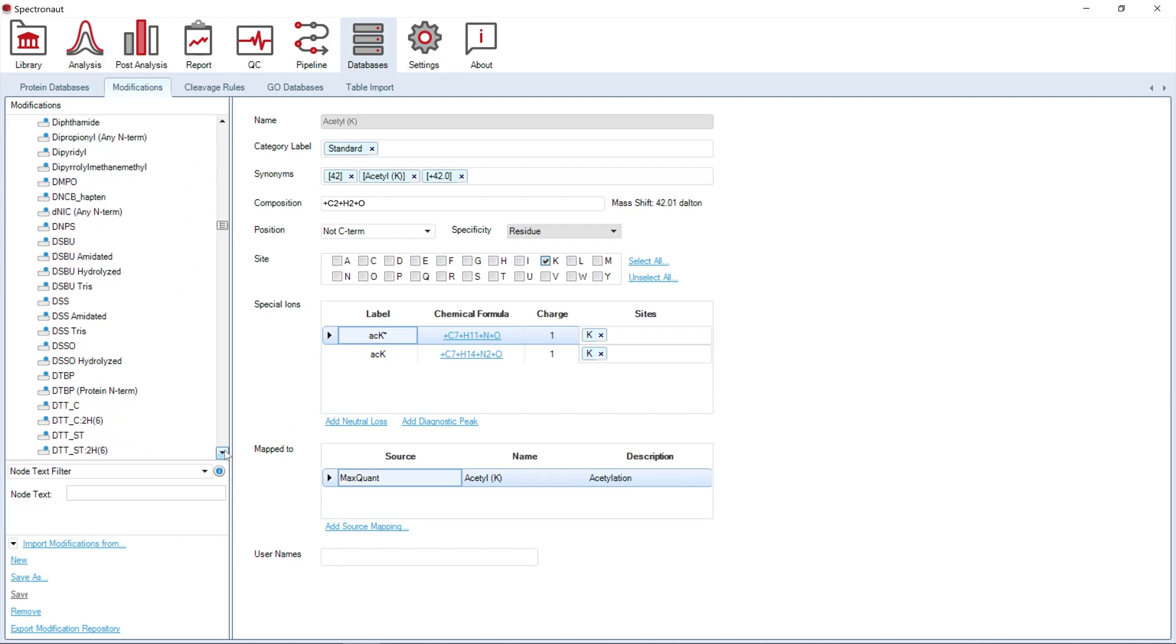Modifications contained here are used for searches performed in Spectronaut, but also serve as a modification definition resource. This resource will be used for automatic detection of modified sequences in search engine output whenever you create a spectral library from an external search engine.